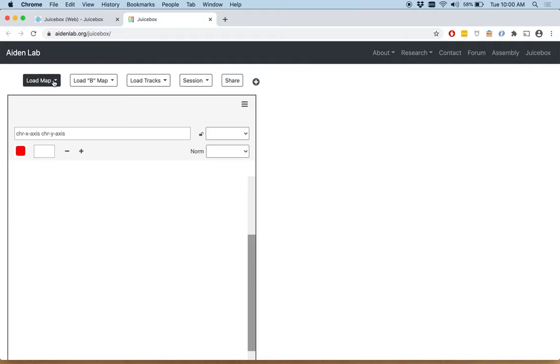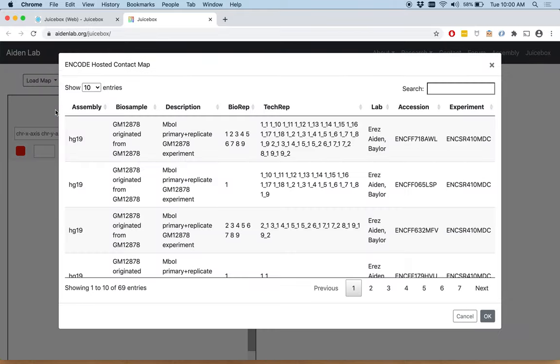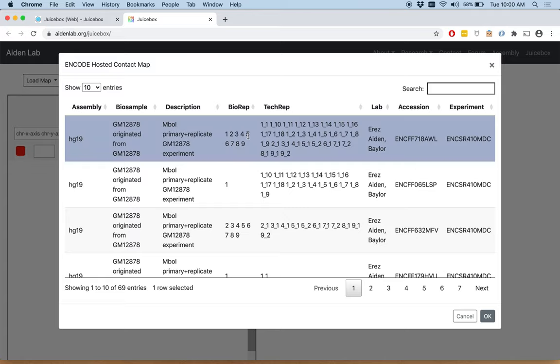Click Load Map, ENCODE. You will see a list of the HI-C files available on ENCODE. We're going to look at the first one, which is the GM12878-MB01 Primary and Replicate Map. Click it, and then you have to click OK.